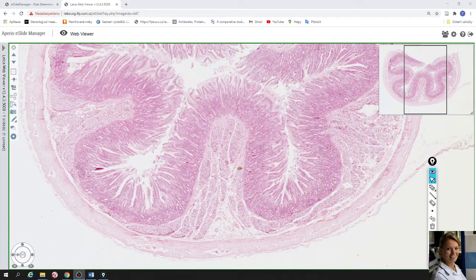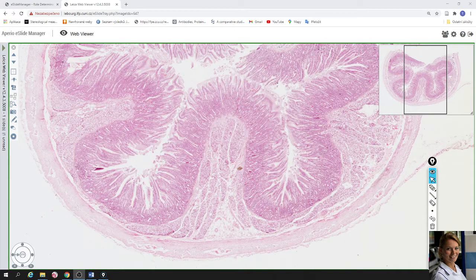In this video we will take a look at the slide of duodenum. The slide is stained by hematoxylin-eosin. That means that the nuclei of cells are violet or blue and the cytoplasm of cells is pink.